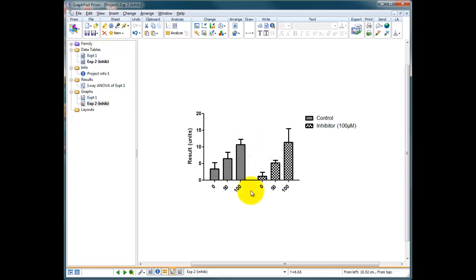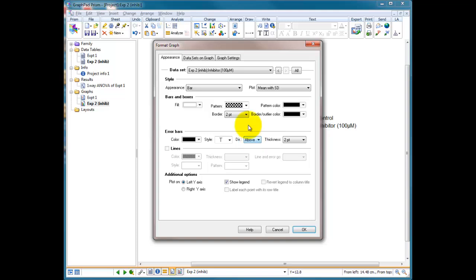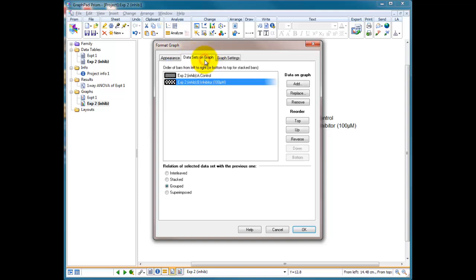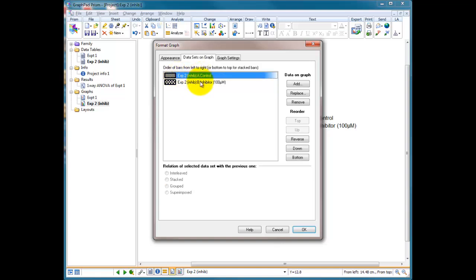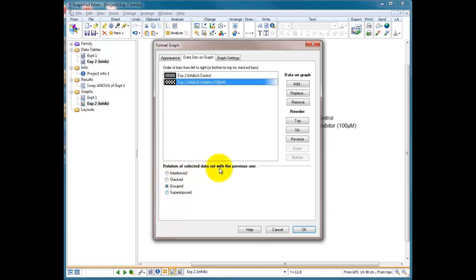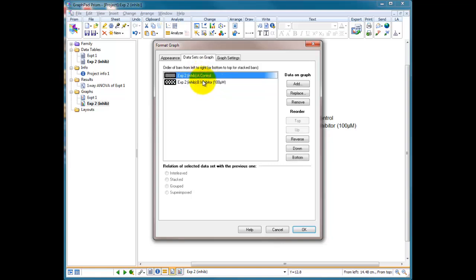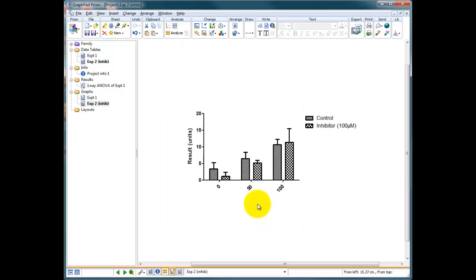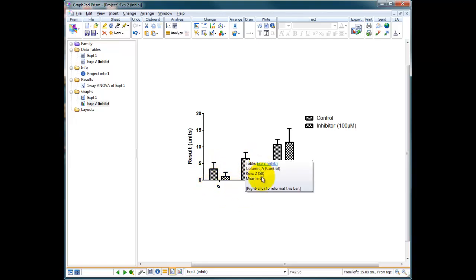So I can choose the way these data are expressed. I can double click in the middle here and up in the options data sets on graph click on here and you can see I've got my two data sets my control and my inhibitor and down here you can see it says relation of selected data set with the previous one. At the moment it's grouped so it's grouping all of the inhibitor data together. I want it interleaved with the previous group, the control group. So I can choose interleaved. Press OK and now what it's done is it's put my data next to each other. I've got all my zero treated data with control and inhibitor, my 50 with control and inhibitor, and my 100 with control and inhibitor.